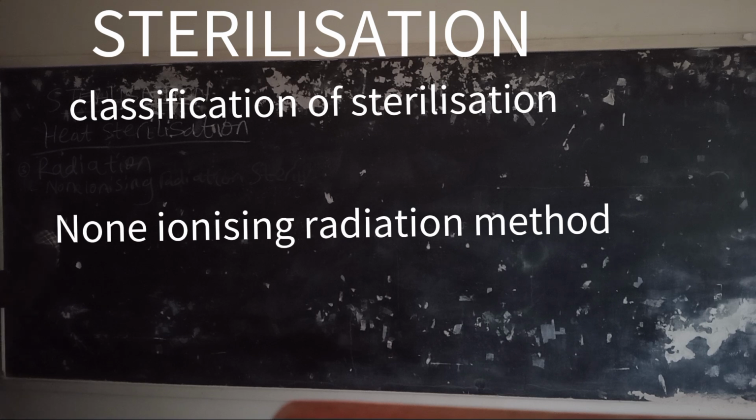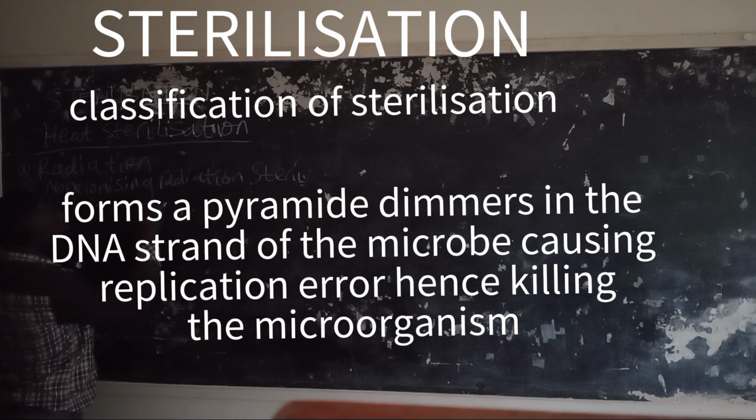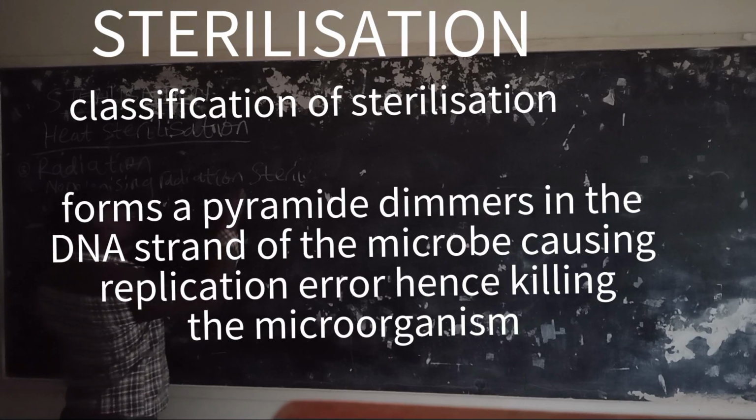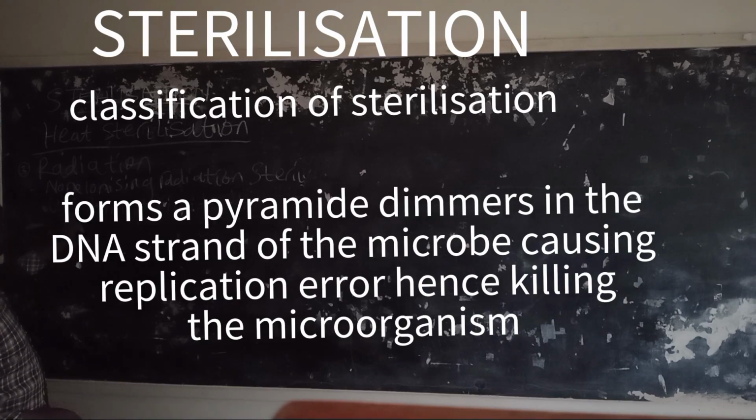With non-ionizing radiation, we use ultraviolet rays, which penetrate and are absorbed by the nucleic acid in the microorganisms, and then form pyrimidine dimers.